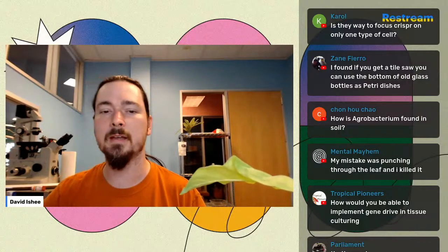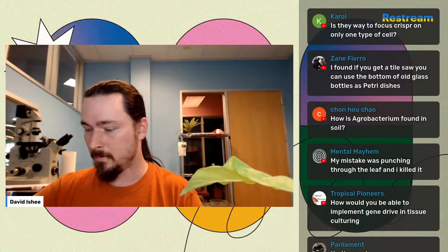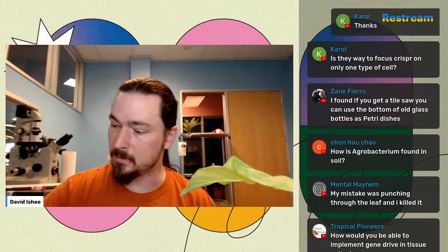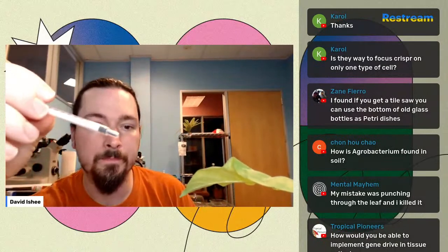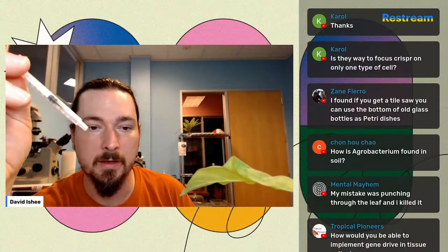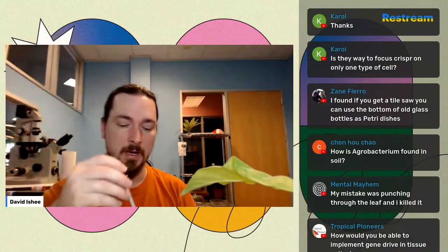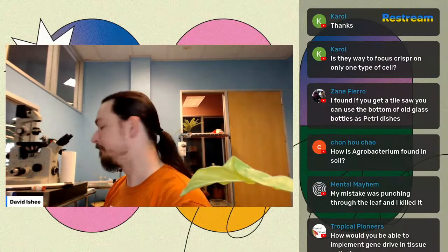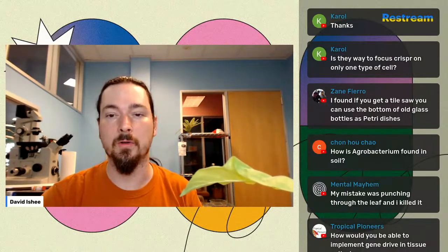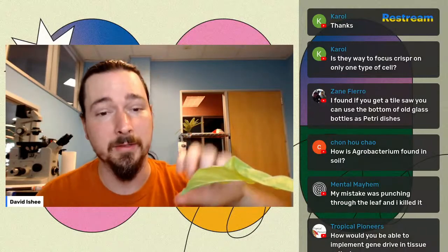But to answer the other question, let's go with some technical tips on how to not punch holes in your stuff. I like these little bitty syringes. They're small, and it's maybe not what everybody's used to, but every bit of plunger depress moves a really small amount of liquid. So it gives you some fine control, because you're not moving so much liquid in one go, but it really depends on what you're comfortable with. So I'm trying to get this on the laptop.